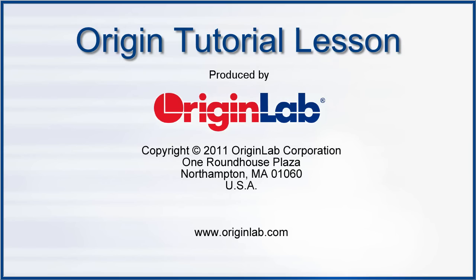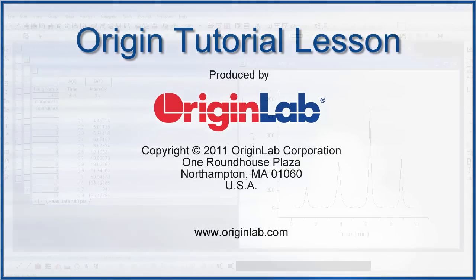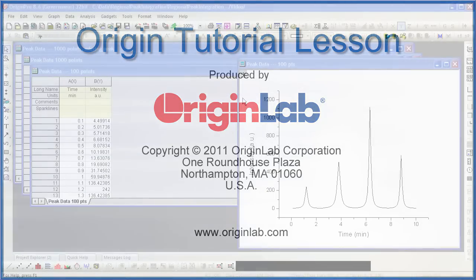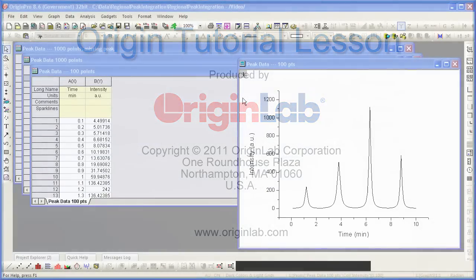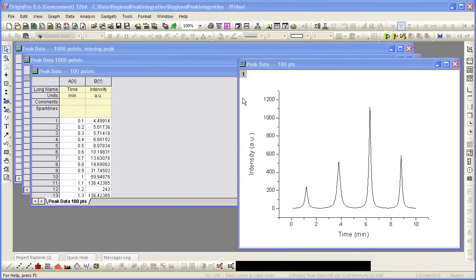This tutorial demonstrates a way to analyze peak data in which the desired peaks fall in the same X range for each dataset.